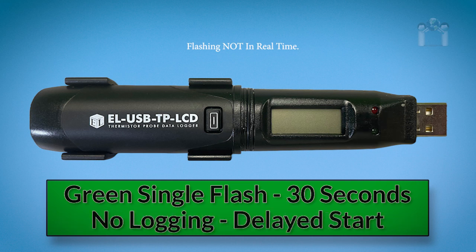A green single flash every 30 seconds means the data logger is not currently logging but is primed to start at a later date and time.